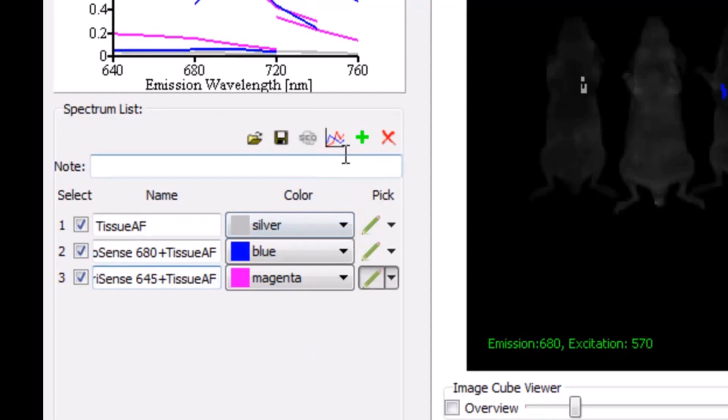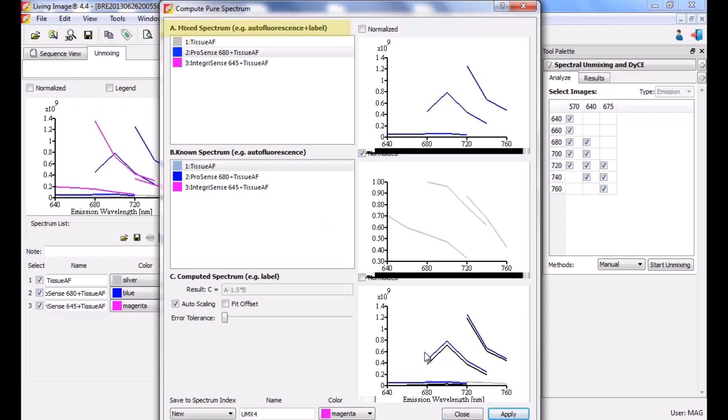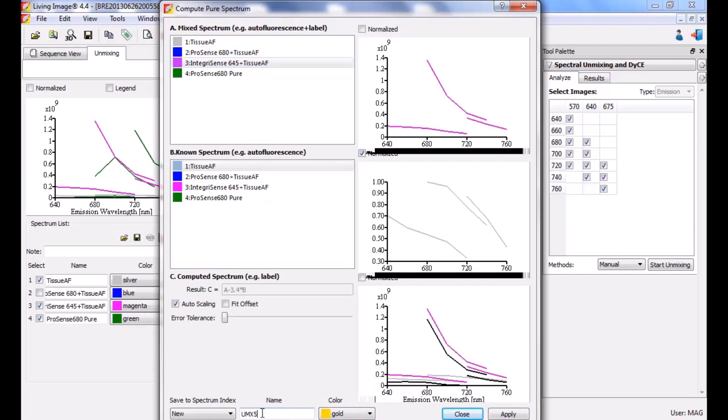We have two goals: one, to separate the 680 and 645 probes, and two, to separate tissue autofluorescence from both probes. To lend specificity to the unmixing so that the autofluorescence will unmix from the probes, we need to perform component subtraction to generate three pure components. Click the compute pure spectrum button. The compute pure spectrum window opens and asks for input. Section A contains mixed spectra and section B contains the known spectra or tissue autofluorescence. We will subtract B from A to generate pure probe components. Select the 680 probe in section A and tissue autofluorescence in section B. Name the pure probe at the bottom and click apply. Repeat this process for the 645 probe.